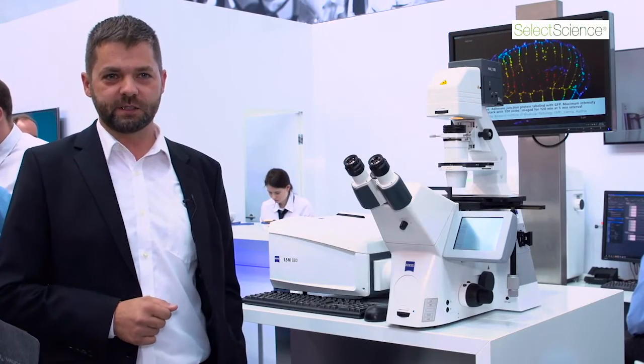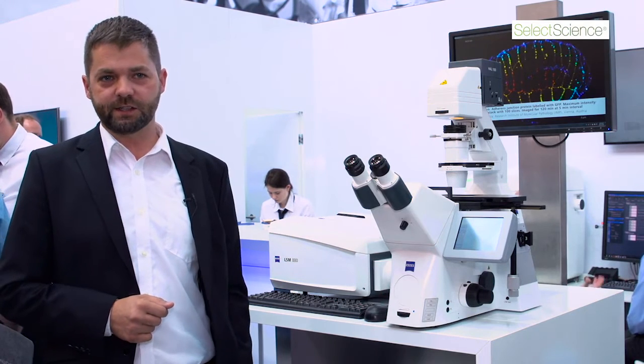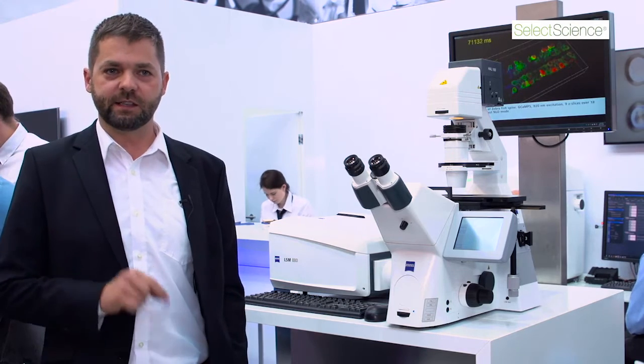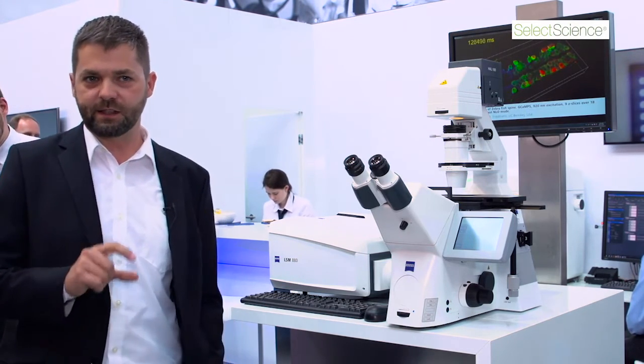The newest innovation from Zeiss, based on LSM 880 and AirScan, is a module called AirScan Fast. With AirScan Fast, we don't illuminate a single spot in the specimen, but rather an extended area.